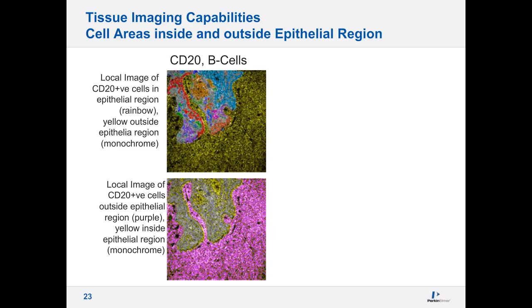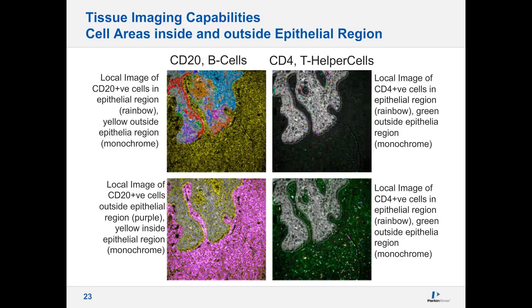So again, here you can see within the cytokeratin positive cells, we can start looking at subpopulations within that layer. So we're talking about several different layers that we can look at, and these subpopulations, both CD20 B cells and also CD4 T helper cells. And you can build this list by looking at other immunological phenotype measurements, because it's really going to depend on your question and what you're interested in looking at. This technology, this approach, really opens up a lot of avenues and doors. It's something I wish I had several years ago.